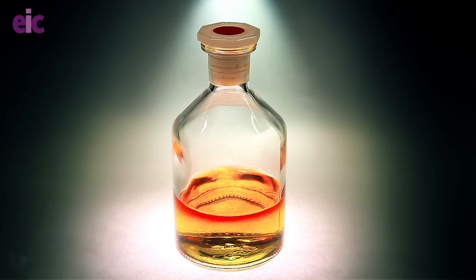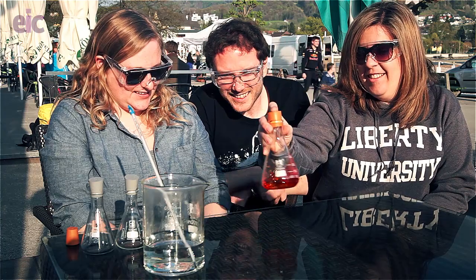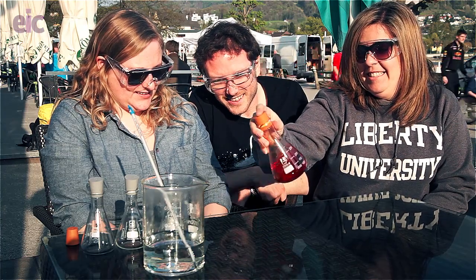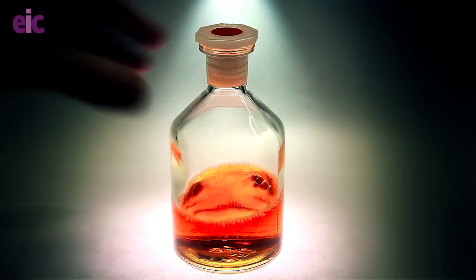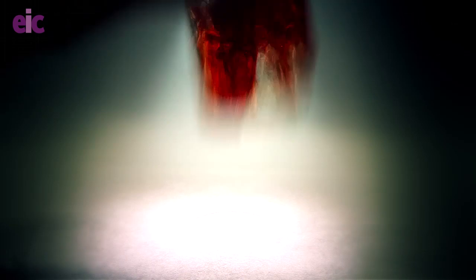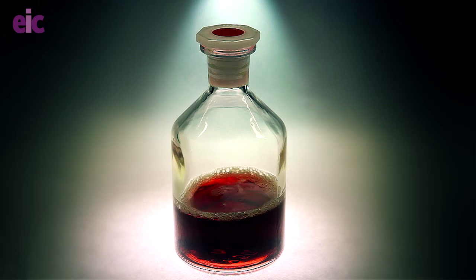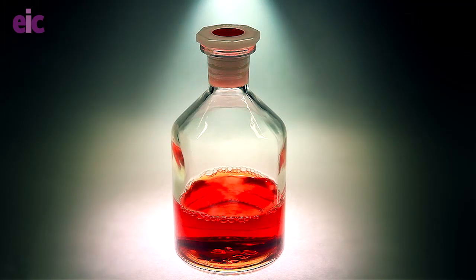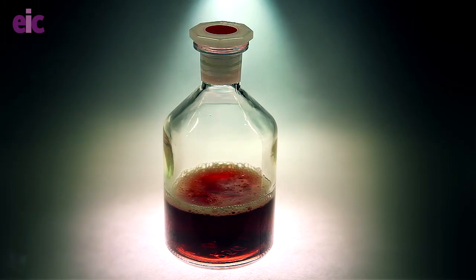So what do you think is going to happen if you shake that? I think it's going to clear. Okay, give it a try. Keep going, harder. Oh my goodness! Try and keep the stopper in. It's turning back to all the different colors - and now it's going back to red, and then orange, and then yellow. Should I shake it again? Yeah, go for it, it carries on doing the same thing.